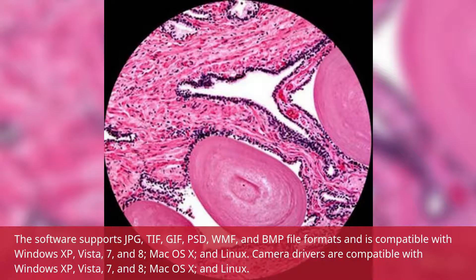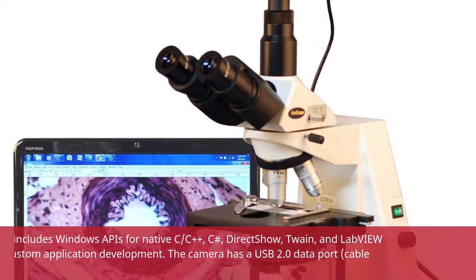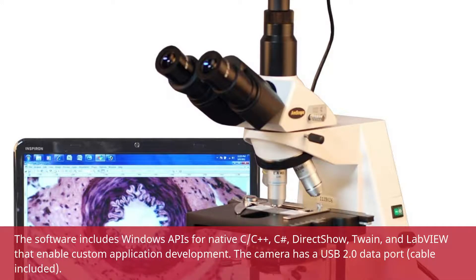Camera drivers are compatible with Windows XP, Vista, 7, and 8, Mac OS X, and Linux. The software includes Windows APIs for native C/C++, C#, DirectShow, Twain, and LabVIEW that enable custom application development. The camera has a USB 2.0 data port with cable included.